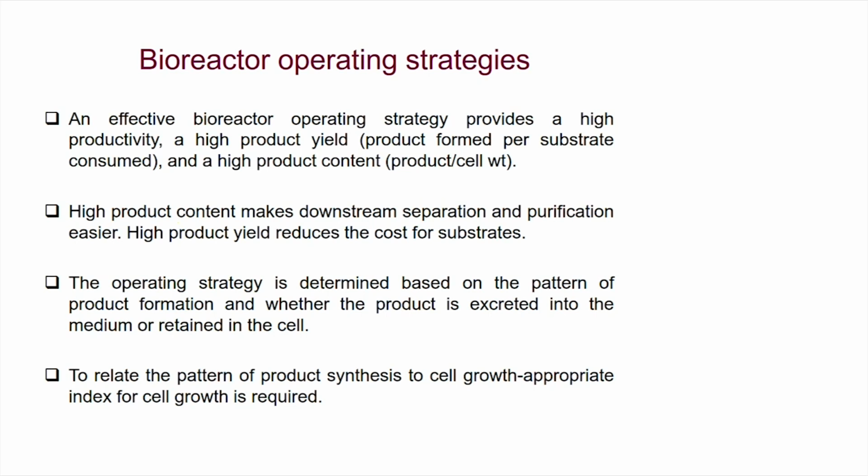Which means that what the composition of the feed should be will also be governed by what I have studied in the batch, whatever optimization I did in the shake flask. So, what concentration and what composition of the feed I should be feeding in will now be determined at the reactor level, which can further improve the productivity in the same reactor. That is what bioreactor operating strategies are, where you can even do it as a fed batch or a continuous cultivation in the chosen reactor configuration.